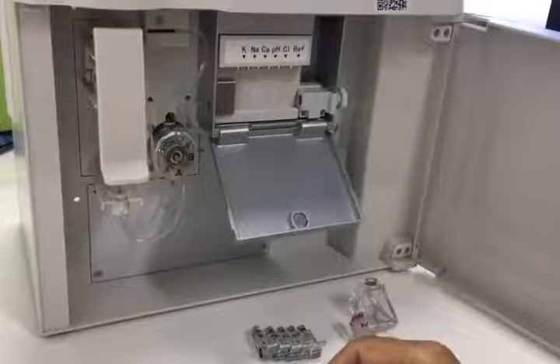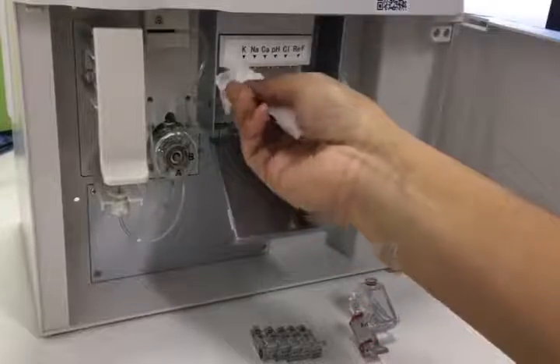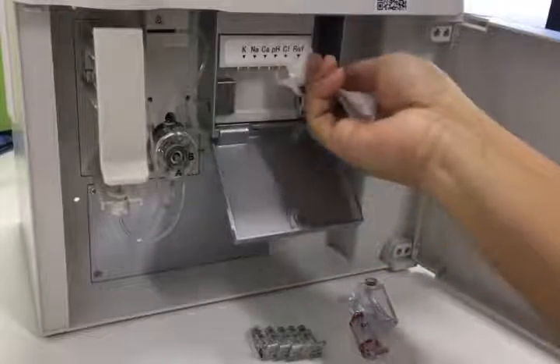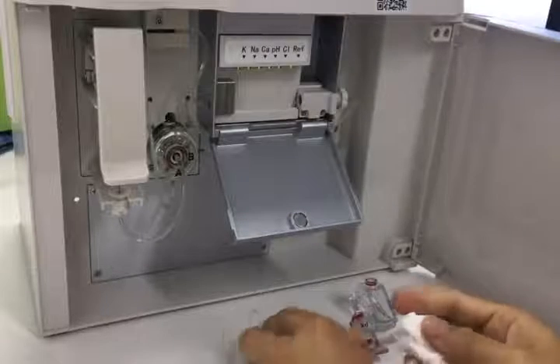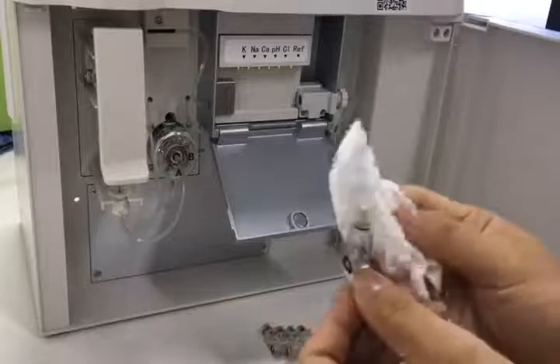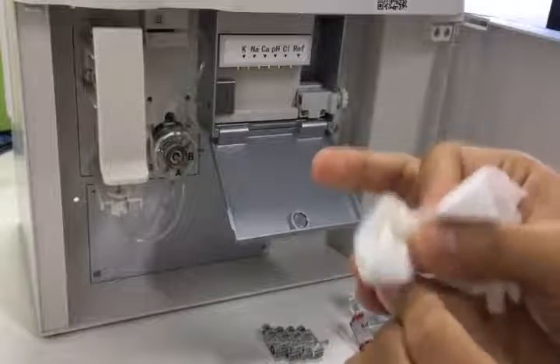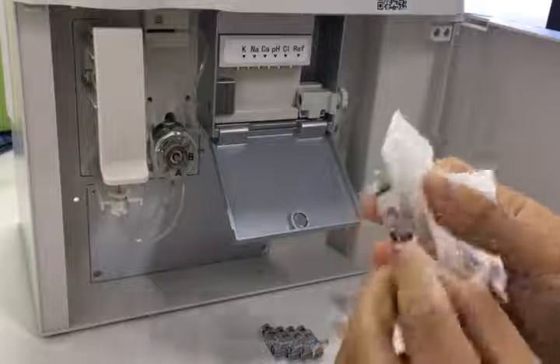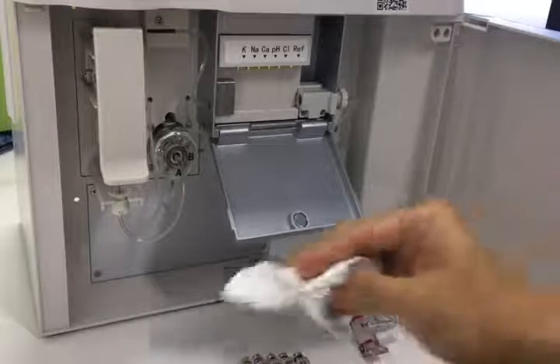Before we do the installation, we use tissue to clean the metal contact on the electrode box. Then we use tissue to clean the metal contact for the electrode and the gas ring, to keep the electrodes clean. We need to do the cleaning for each one.